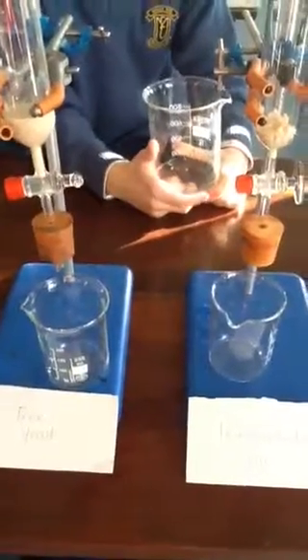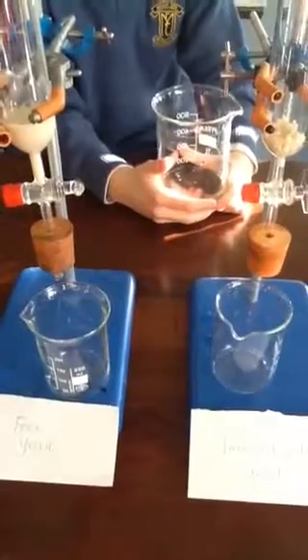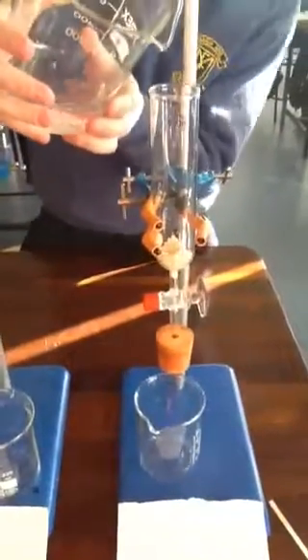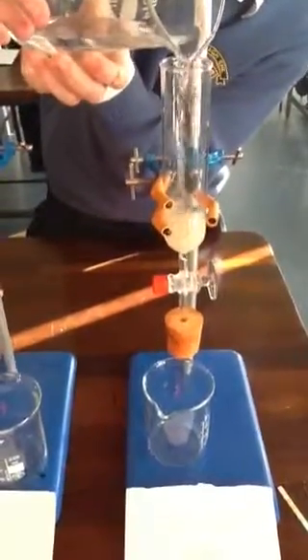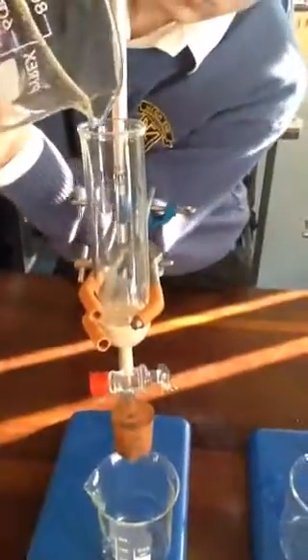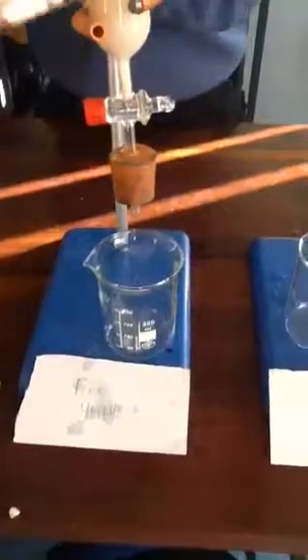We have immobilized the yeast and we're going to now test its use. We're going to pour half of this sucrose solution into the separating funnel that contains the immobilized yeast, and then the other half is going to be poured into the separating funnel that contains the free yeast.